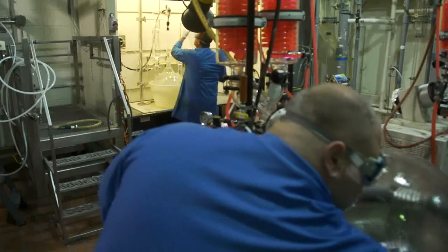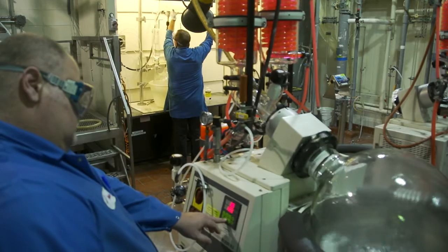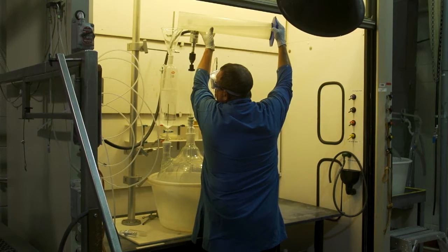Lean manufacturing also means high efficiency, especially when it includes proprietary processes for large-scale manufacturing of phosphoramidites.